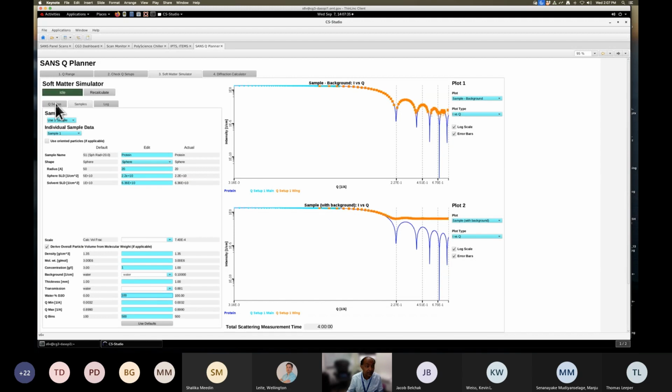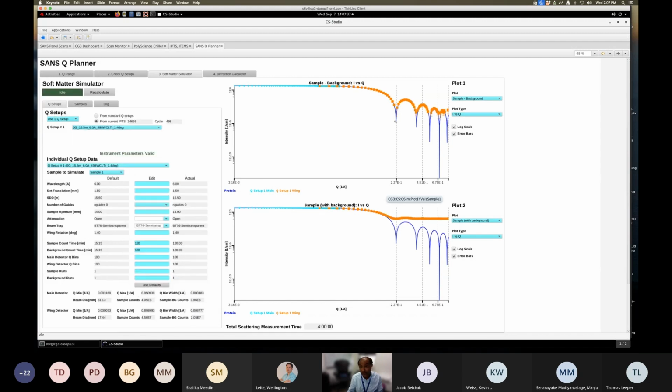It comes back here. And now at 120 minutes, you see how good your error bars are. And you're getting a huge amount of these oscillations. Well, I'm assuming they're spherical, right? But they wouldn't be spherical. They will be sort of a smear. And you can think, as Volker had mentioned, you would be getting more of the envelope here. So let's go back to 30 minutes. And there you go. You still get reasonably good data here, right?